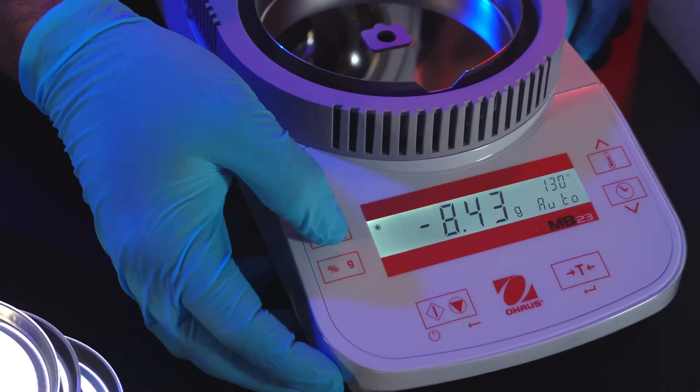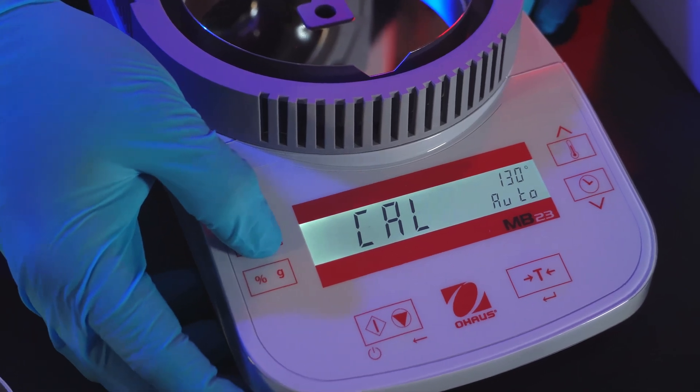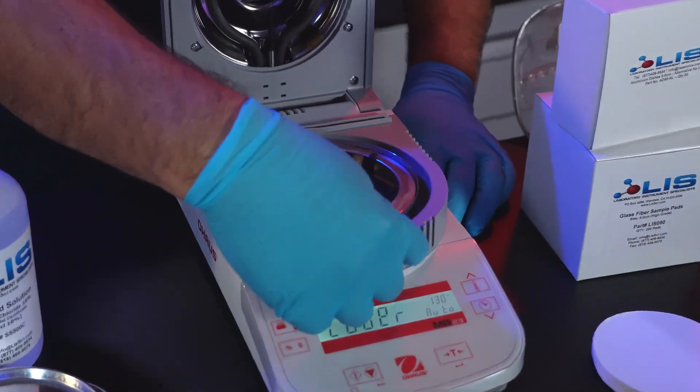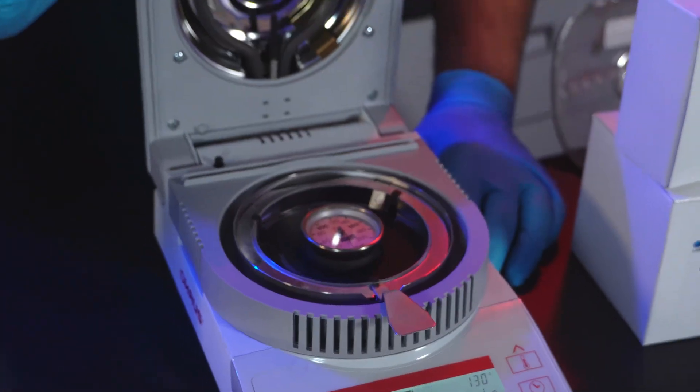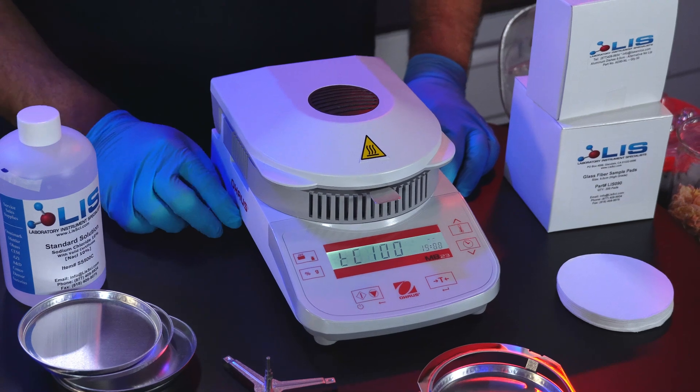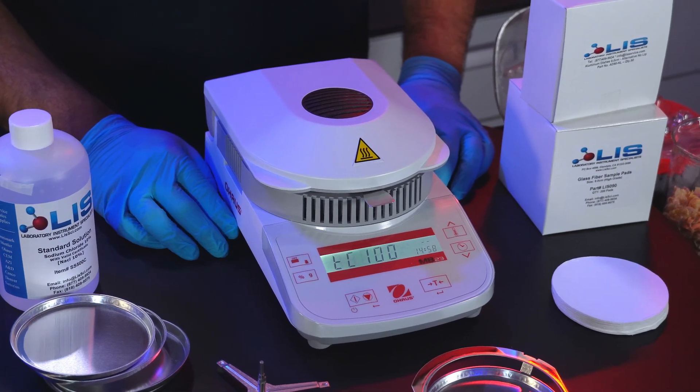Remove the pan support. Press and hold the calibration button, and let go when 'CAL' is displayed. Insert the temperature calibrator. Close the lid and it will automatically begin to calibrate the temperature sensor at both 100 and 160 degrees.